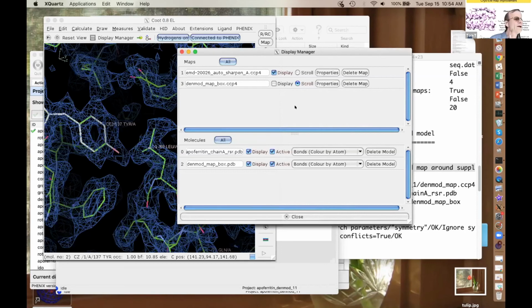Okay, any other questions that I missed here, Paul? Membrane protein, yeah. Question about detergent belt. Would you also supply a model from Mapbox? I'm not sure I quite understand that question. So the reason we did this Mapbox just now was just for convenience, so that we could have a small map to work with in the next step. And I boxed it around the model so that I didn't have to worry about any extra density, and so our model building is going to be easier than it would otherwise be. That's the only reason we did it just now.